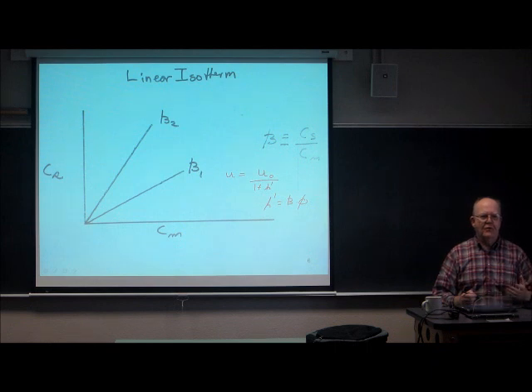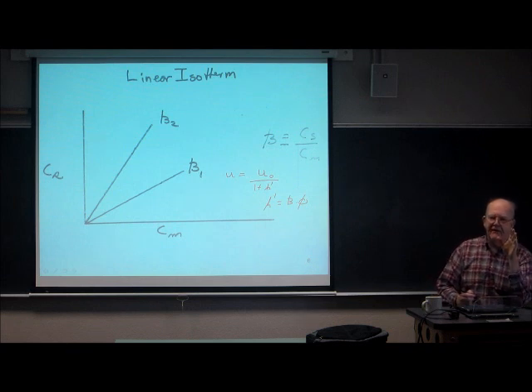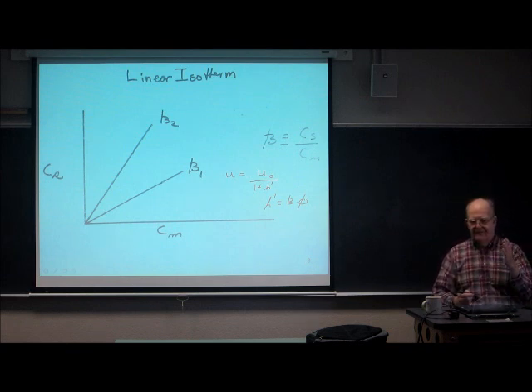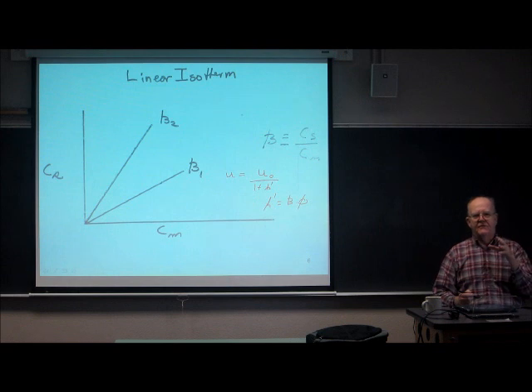The one with the smaller k factor, right? That's going to be beta 1. Okay, so as I increase the k factor, by whatever amount, the zone moves slower.